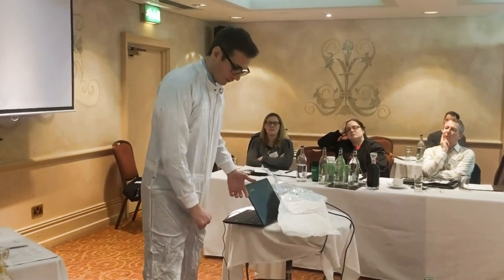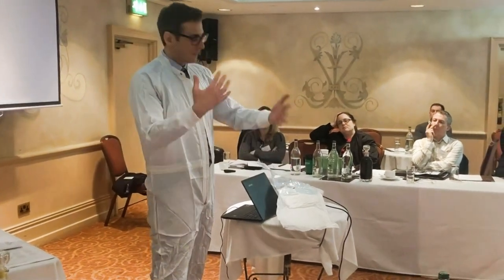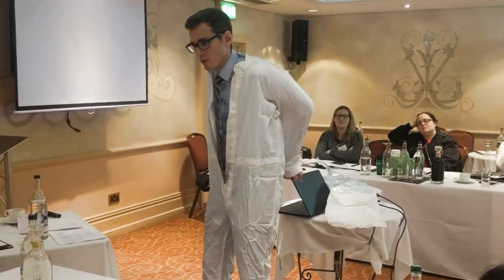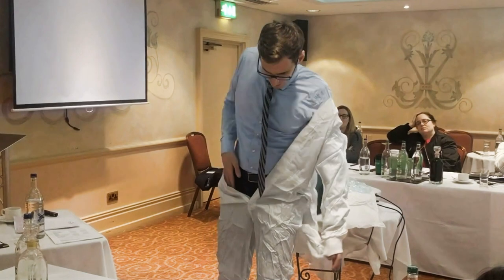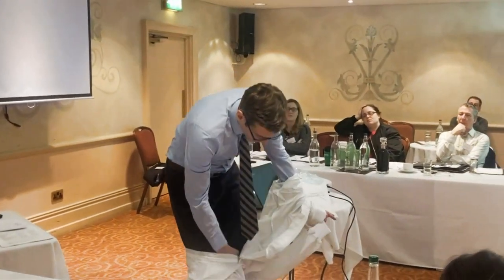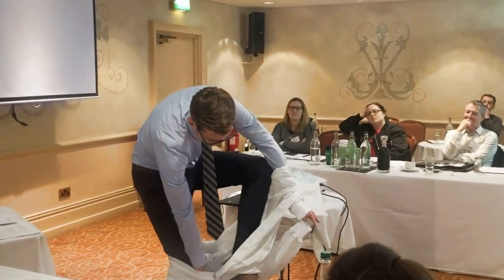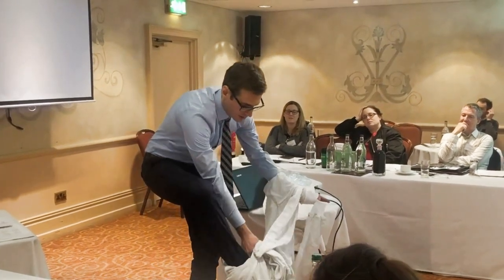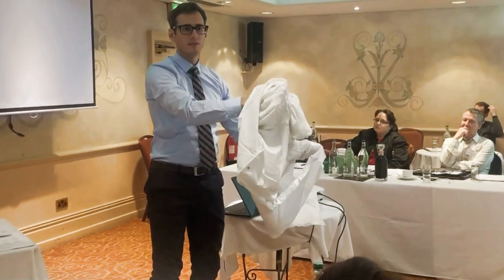So I would open the overall, remove the first pair of gloves, then open the overall, and I try to take the overall only at the end of the sleeves and take control of what happens with the rest of the overall. Get it on the inside of the overall here. And again, I have control of what happens with my legs and with my sleeves.